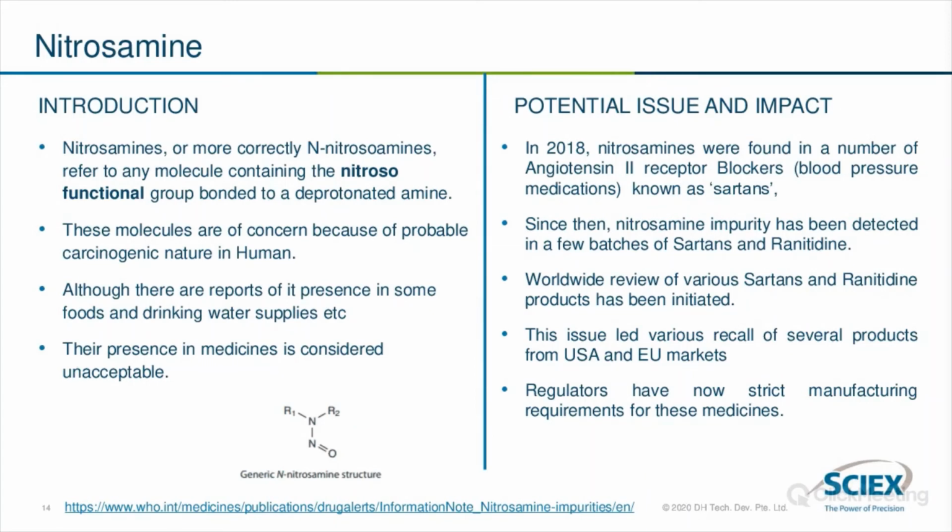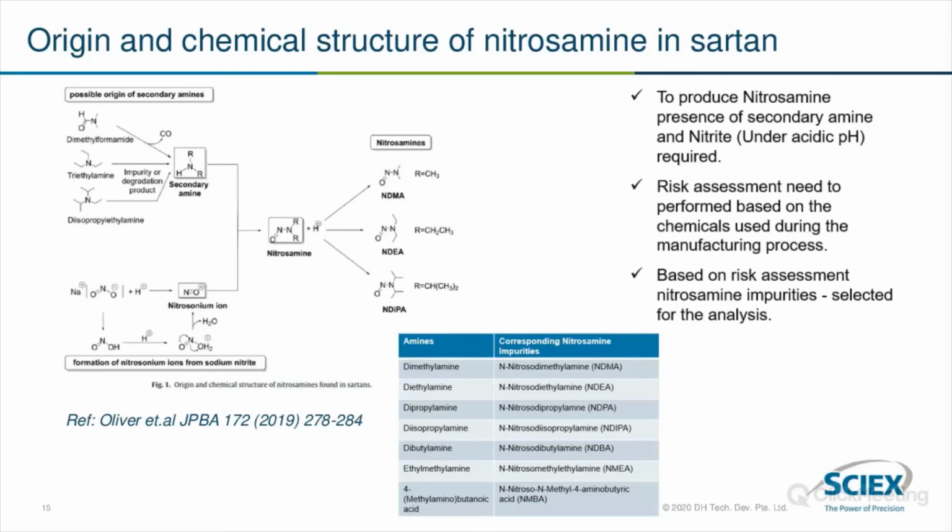And also LCMS is getting widely accepted, especially triple quadrupole and QTrap, for doing targeted quantitation or screening for these nitrosamines in various sartan and ranitidine products. And you can see the references I have listed down, and you can go and check.